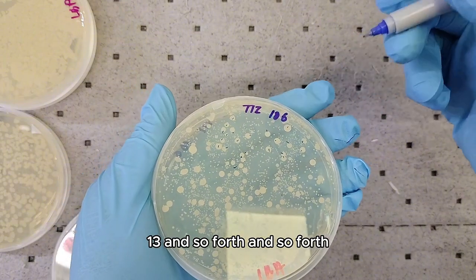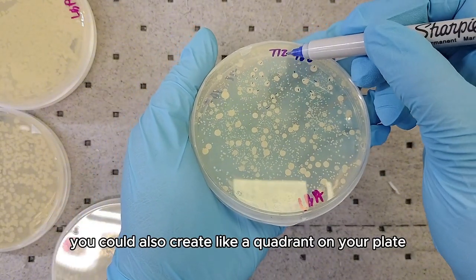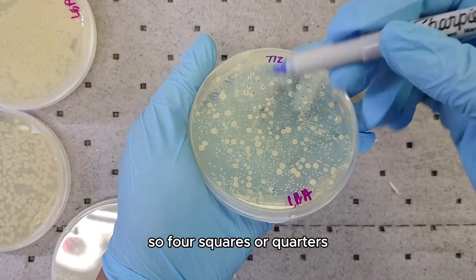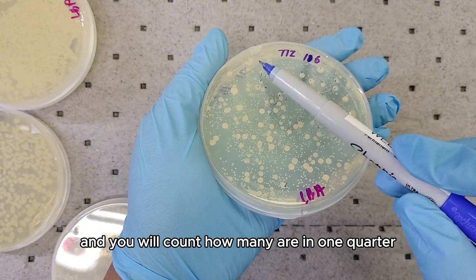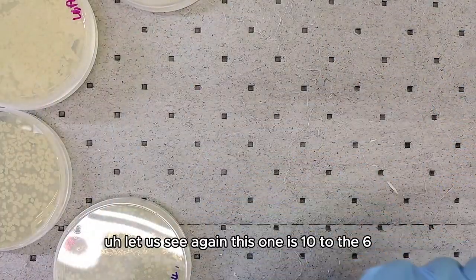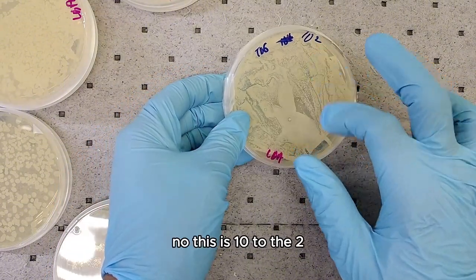I would count one, two, three, four, five... thirty and so forth. Alternatively, you could create a quadrant on your plate — four squares — and count how many colonies are in one quarter, then multiply that by four as an estimation.